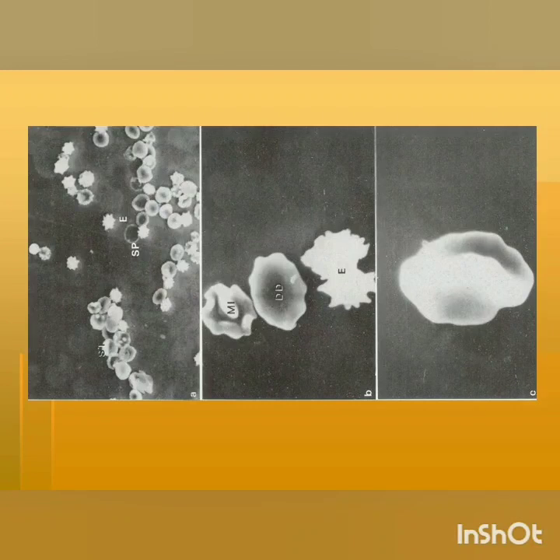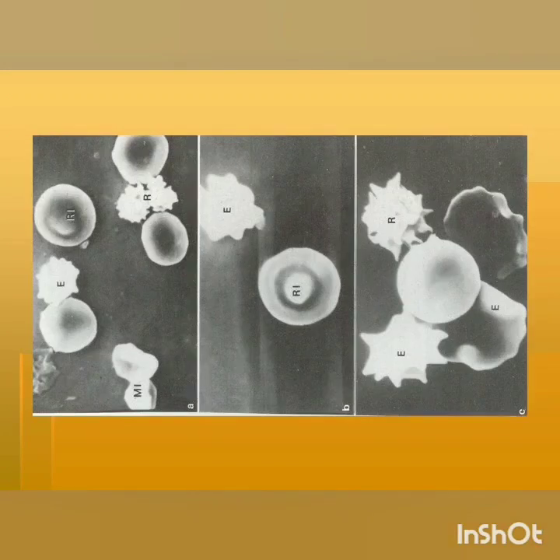In the third picture we can see membrane internalization, which is also an indication of hemolysis. This is the ring-shaped erythrocytes. This also expresses the hemolytic nature.